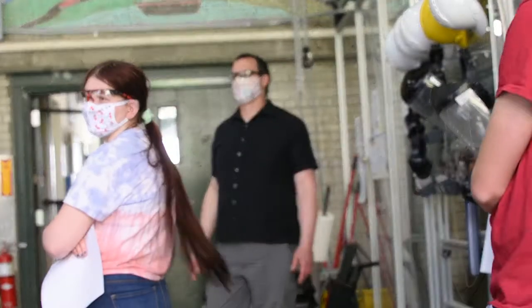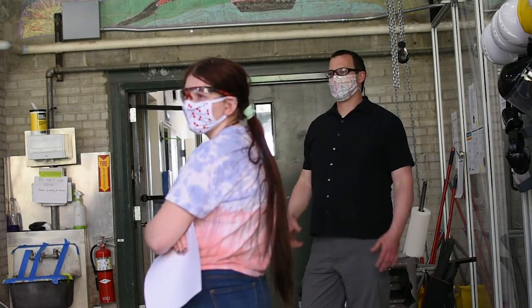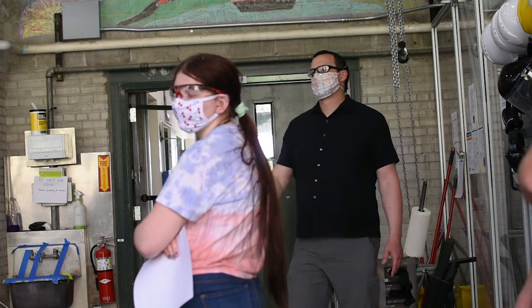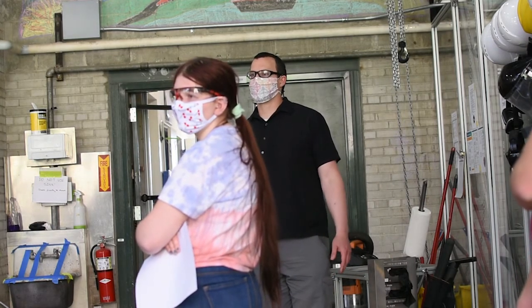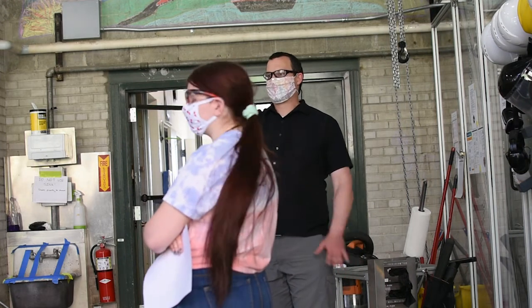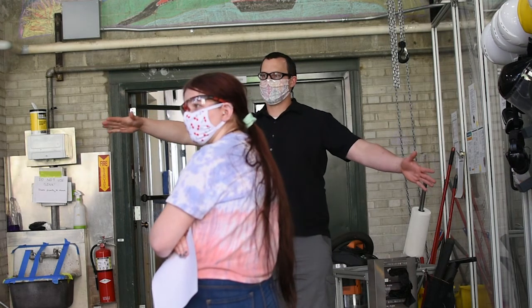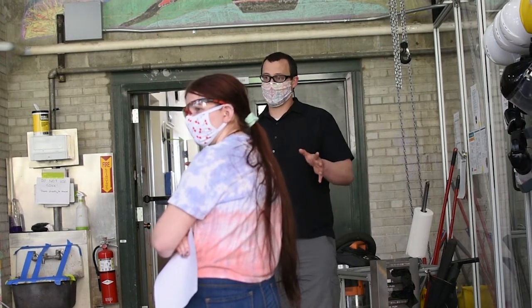Imagine multiplying that little container of liquid nitrogen by 700. When that boils away, that's how much it's going to displace. About 35 times 20 makes 700, so 35 of those over 20 high, that's how much oxygen you would displace. So that gives you a quick way to do the math to figure out exactly how big of an area you need to be worried about.